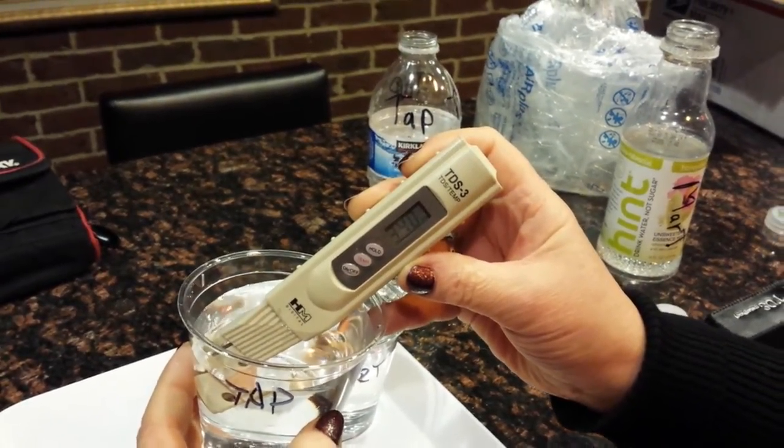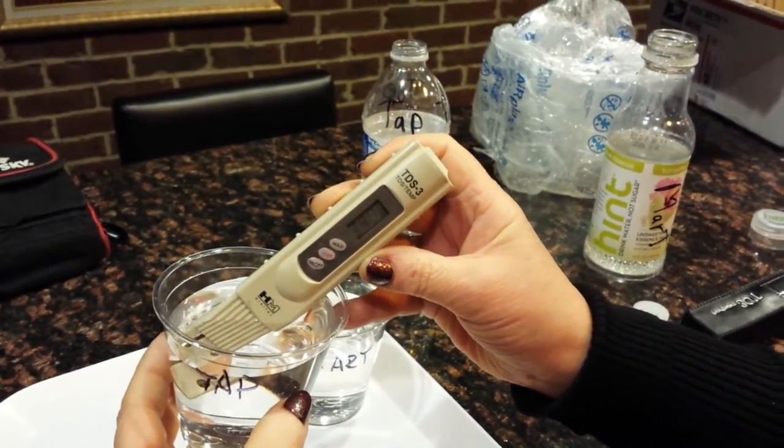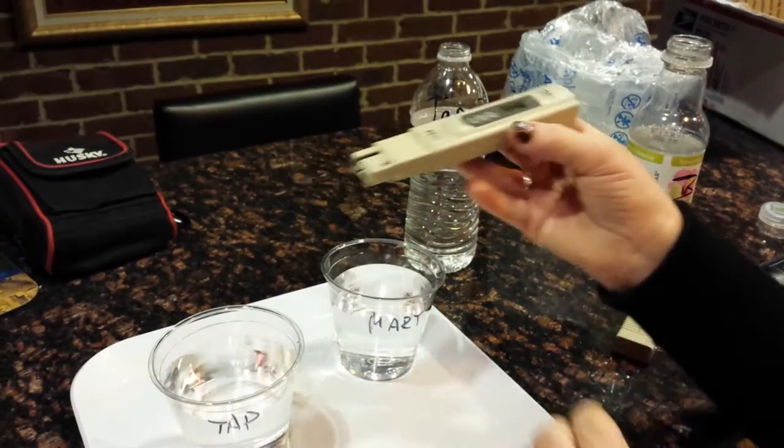300, 400 — is that a 4? 340. Oh my god. 338, 339, 340. Wow — 340. Okay, that's his tap water.